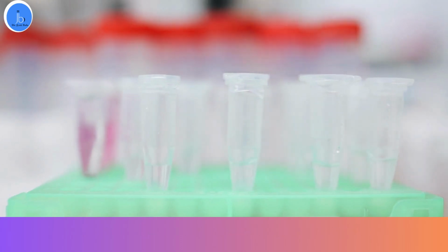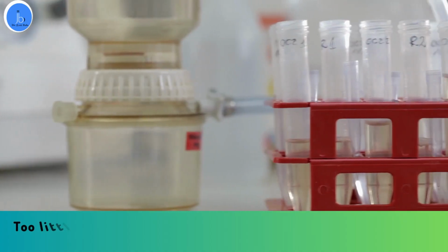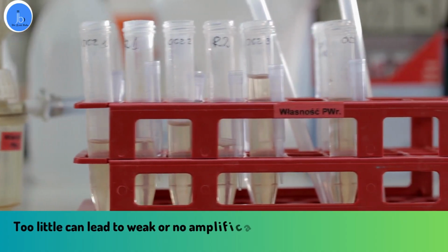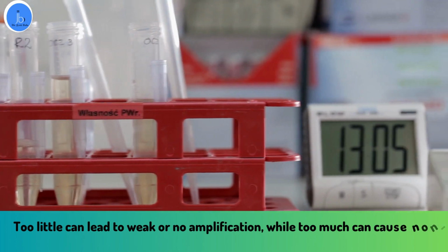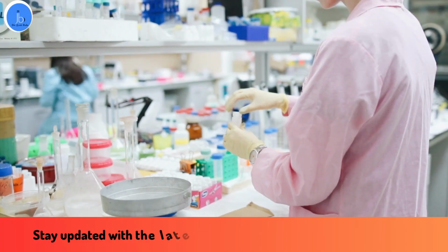Mistake number 3 is the use of insufficient template DNA. Make sure to add the right amount of template DNA to your PCR reaction. Too little can lead to weak or no amplification, while too much can cause non-specific amplification.